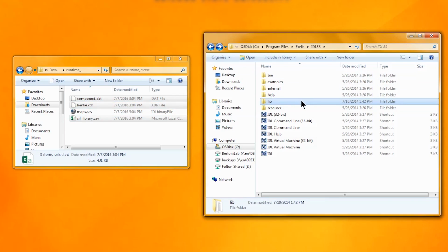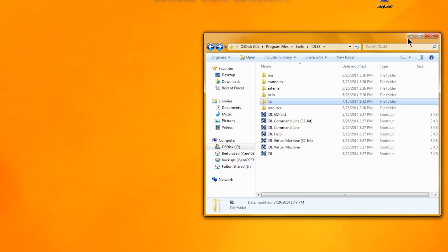Generally, it is convenient to run the fitting from the desktop. However, it is critical that the folder name and the pathway do not contain any spaces or special characters. Otherwise, MAPS will produce an error when attempting to run the fitting. If the pathway to the desktop does contain spaces, place the folder elsewhere, for example, directly within the C drive.